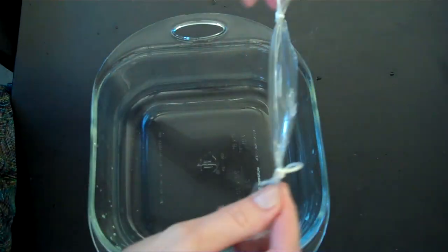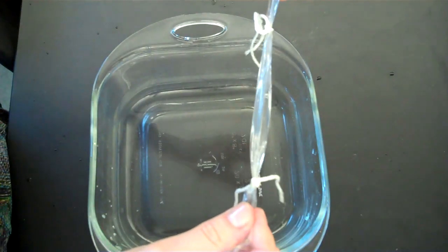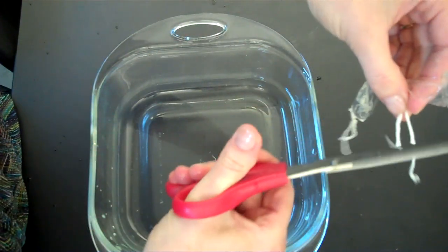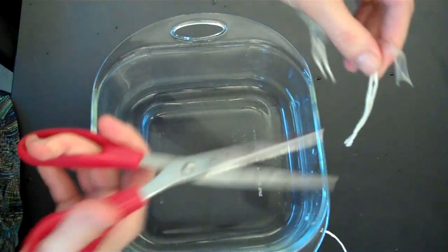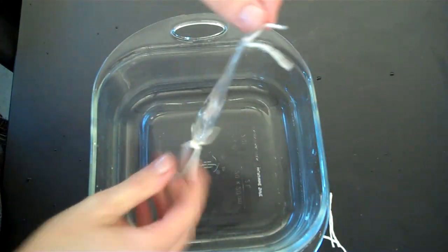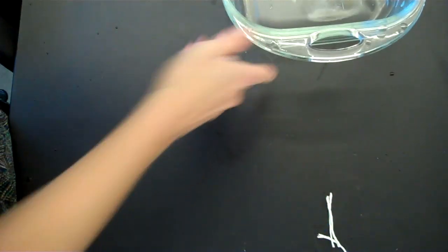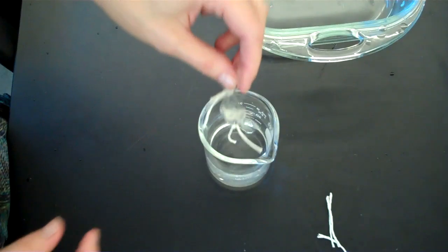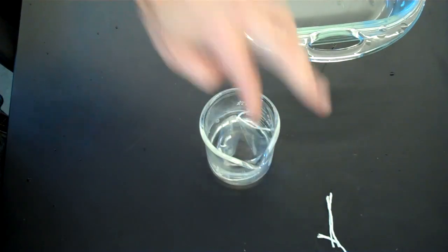And now you have a dialysis bag. If you want, you can cut some of the string. Remember, you do need to weigh this bag prior to inserting it into the beaker of liquid. So after you've done that, just put it in the liquid and wait.